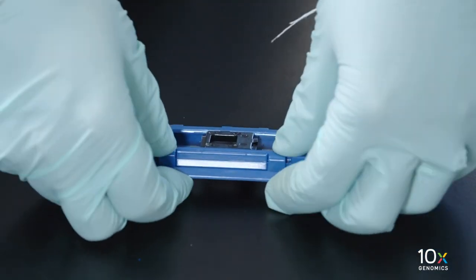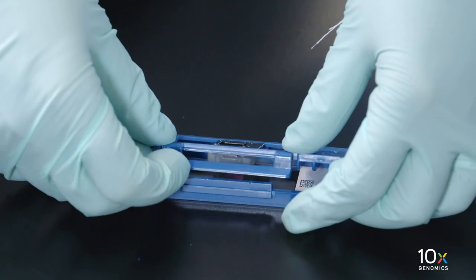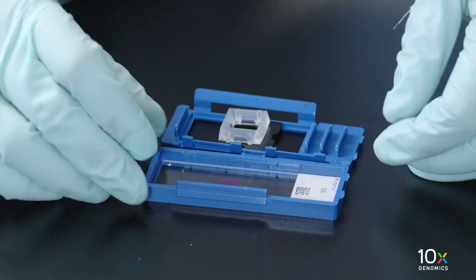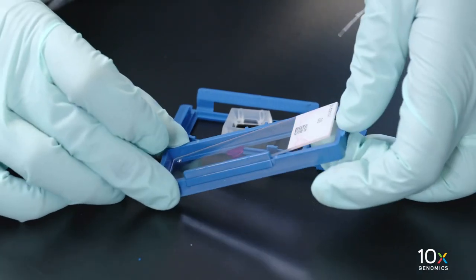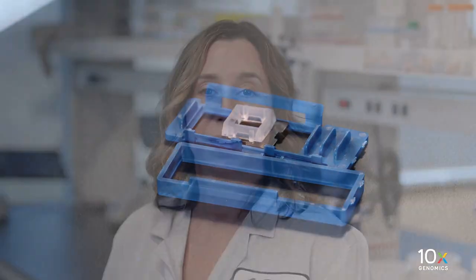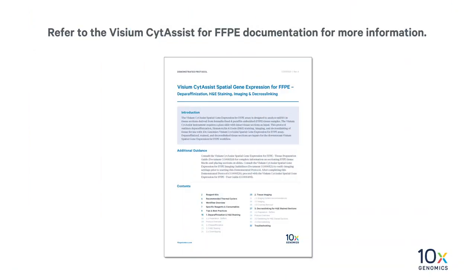Pull the clip up to detach the upper and lower halves of the cassette. Open the cassette by continuing to lift the clip upward. Hold the slide by the label and lift the slide out from the lower half. We demonstrated the Visium Side Assist Tissue Slide Cassette assembly and disassembly. Refer to the Visium Side Assist for FFPE documentation for more information.